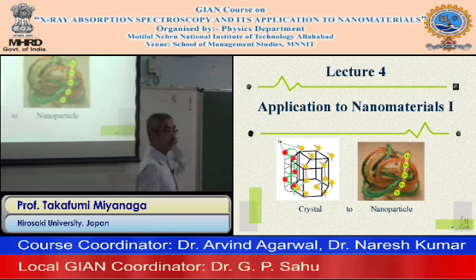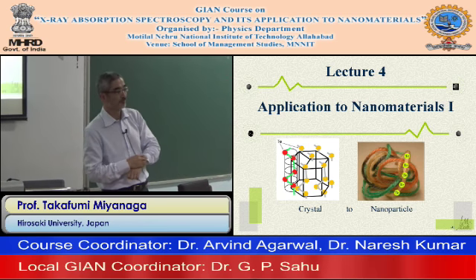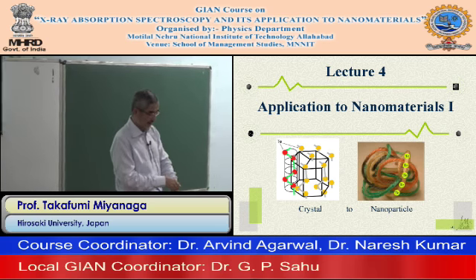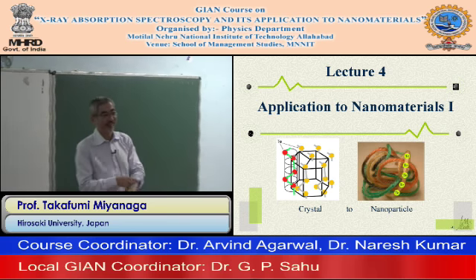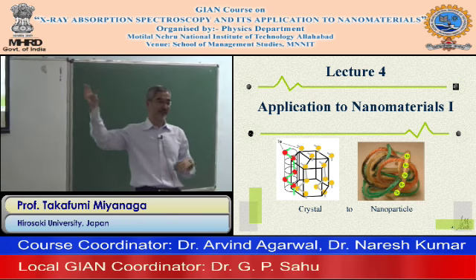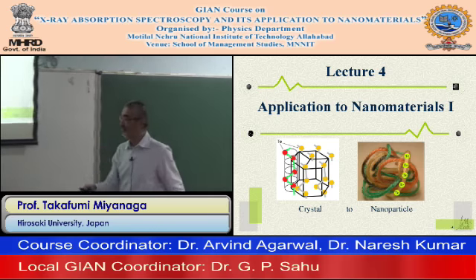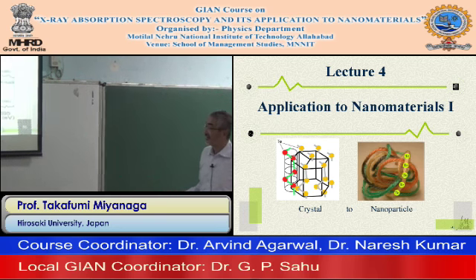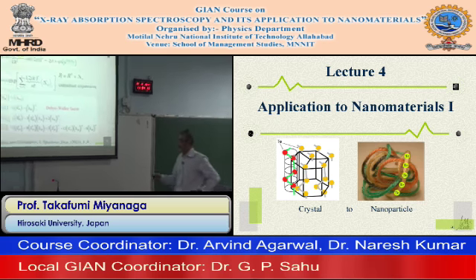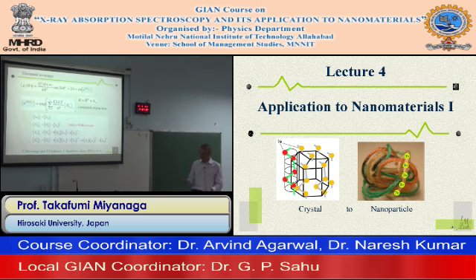Any questions or comments? On the XAFS analysis, if you would like to do field theoretical calculations, the Feynman diagram is also very important, an interesting exercise for you. This review paper covers this type of calculation.